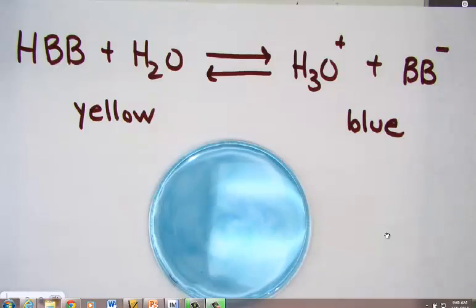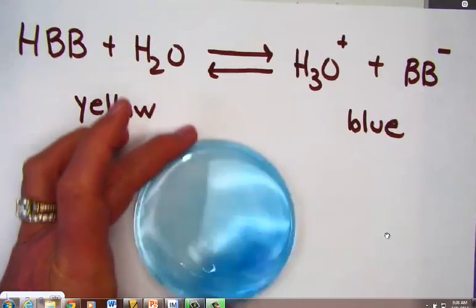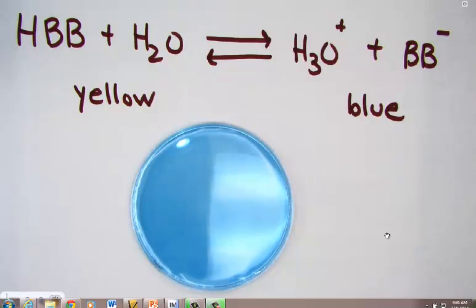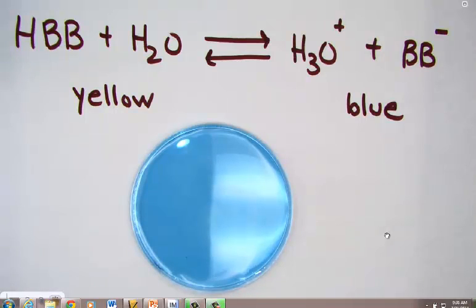Upon the addition of NaOH, I see that the blue color has indeed deepened. First observation: NaOH has deepened the blue color. Let's continue observing before we discuss why.